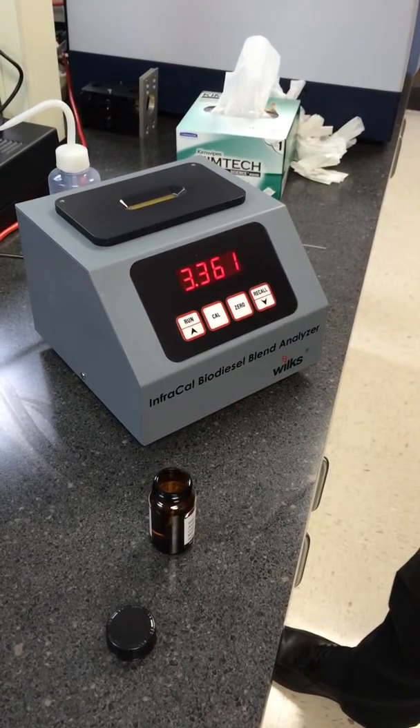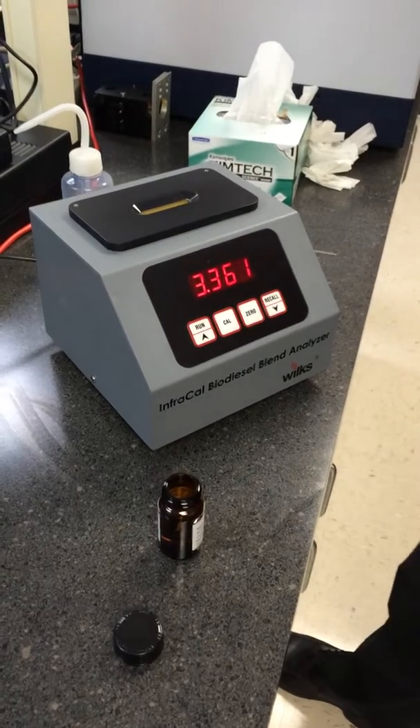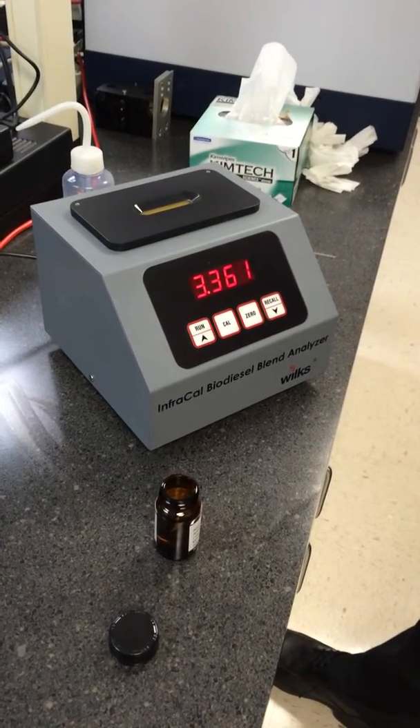A number around three should appear on the screen. If this number gets below two, you'll want to contact Wilks.